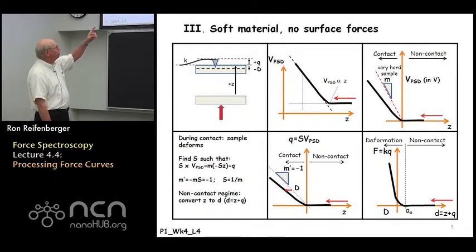That allows you to measure the slope m. That slope m then allows you to calculate the sensitivity of your optical system, right? That sensitivity S then has to be multiplied by the voltage, and that gives you the result that's plotted in the fifth panel of this slide.